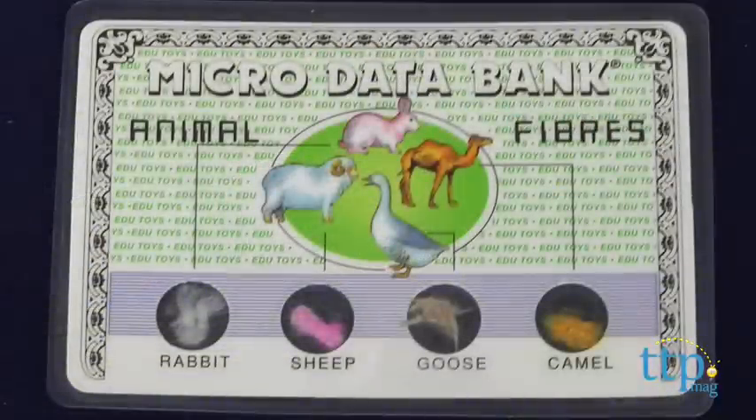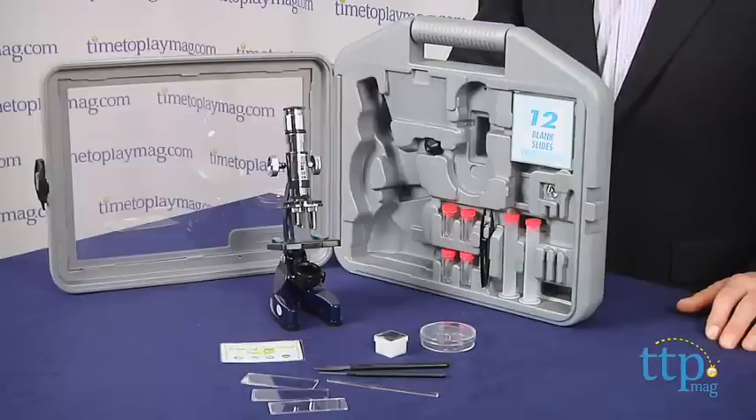There are two prepared slides and sample animal fibers to look at. This is an exceptionally well-designed kit, and for budding scientists, it's a great idea.